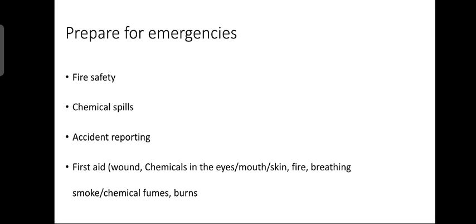Chemical spills. Any chemical is a possible threat to your personal health and your friends. In case of accident causing the release of hazardous chemicals, a calm and determined action is required to prevent accident. For any individual incident, isolation of the spill or securing the area is best prior to contacting concerned personnel. This should be done according to all available information on the chemical nature of the spill.